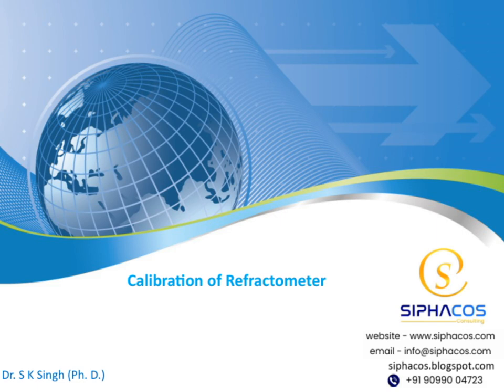Today, we will be discussing calibration of refractometer, a crucial topic in ensuring accurate measurements. This session will cover the basics of refractometer calibration, the tools involved, and the proper procedures to follow. Let's get started and explore how to keep our refractometers properly calibrated for reliable results.